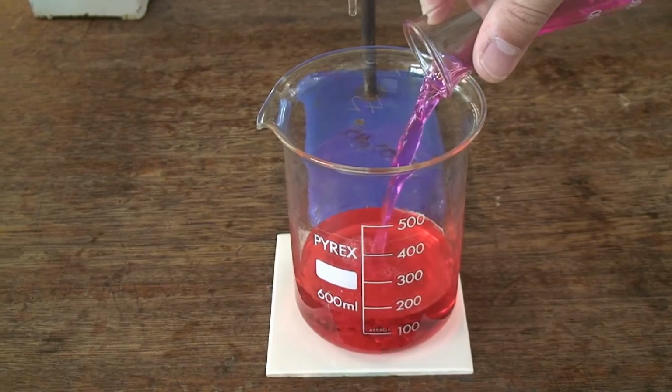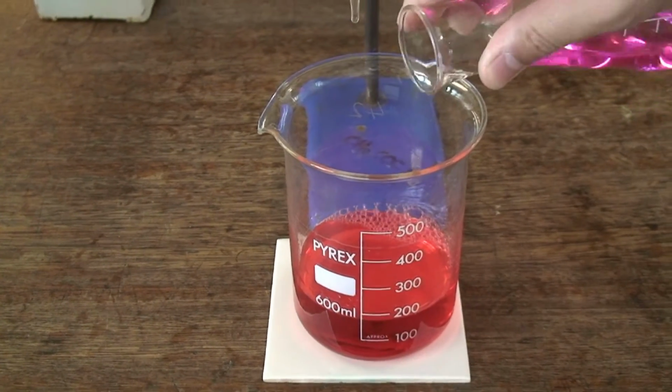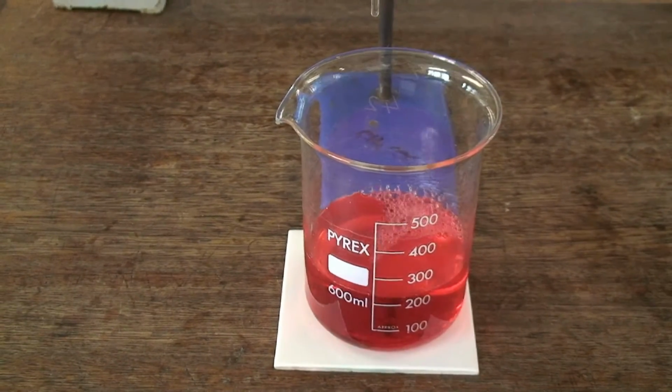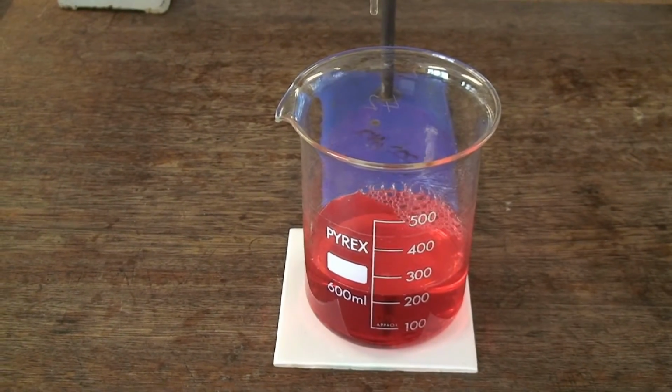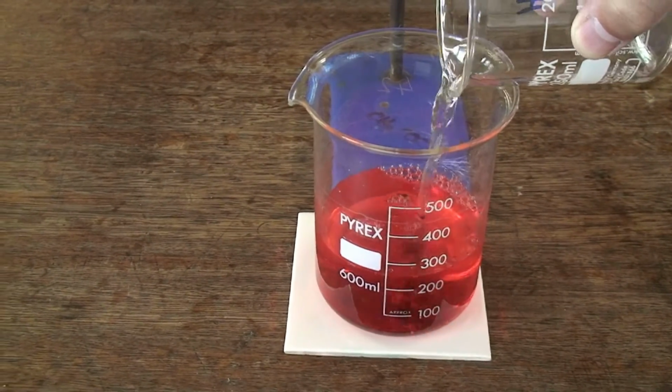Now to dispose of the solutions. Please ask your lab technicians how they would like the solution to be disposed of before you actually do it, but we are going to be using the same waste beaker as before. You can gently pour the solutions from the conical flasks and the beakers and the burette into it.